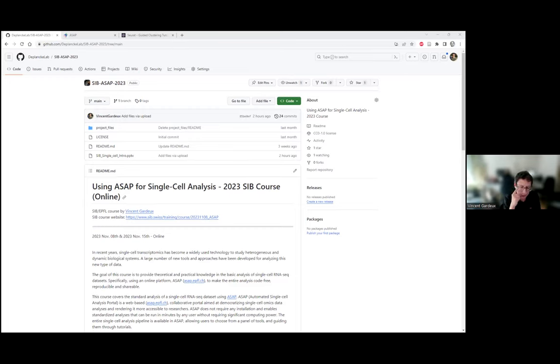So basically in ASAP, when you upload your data, we have a script that runs that tries to map all the genes in your data to the Ensembl database. Those databases are then annotated with gene ontology terms, and other types of ontologies like cell types and so on. If they are non-annotated, they're kept in the data sets, of course, so you can still visualize the expression and everything, but that's it. You will not be able to use them for enrichment in gene ontology and other ontologies or cell types. They are kept, so you don't lose them.